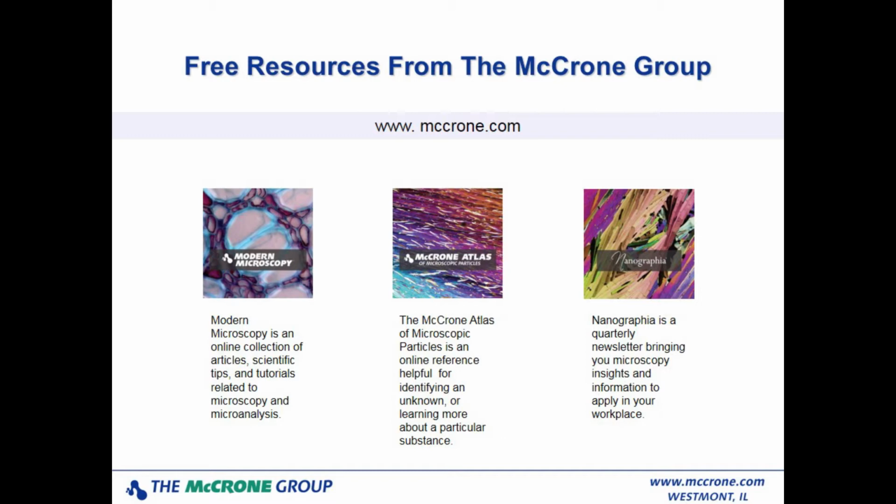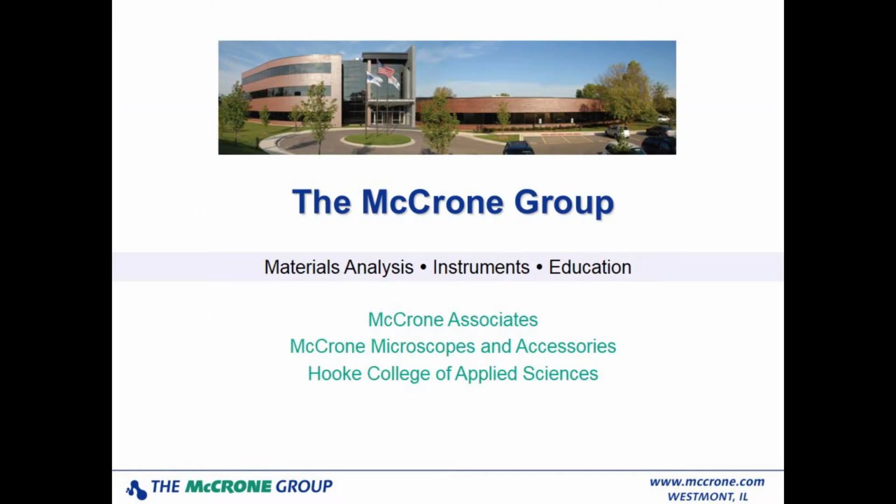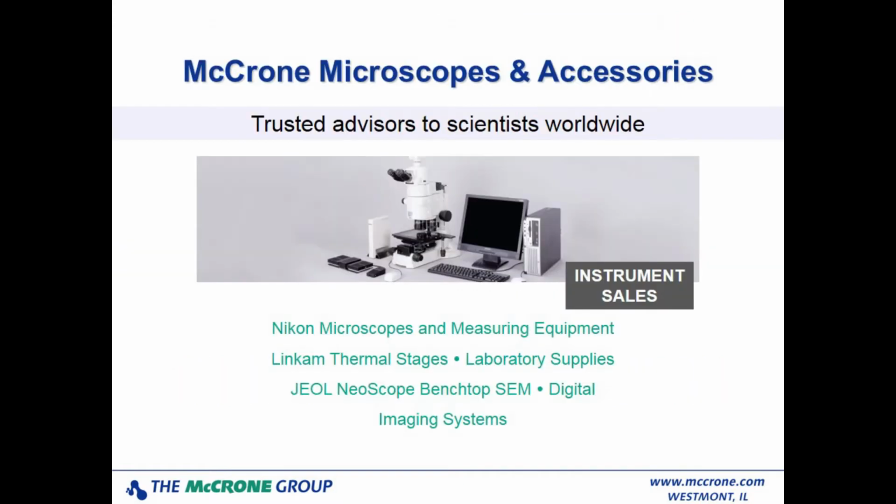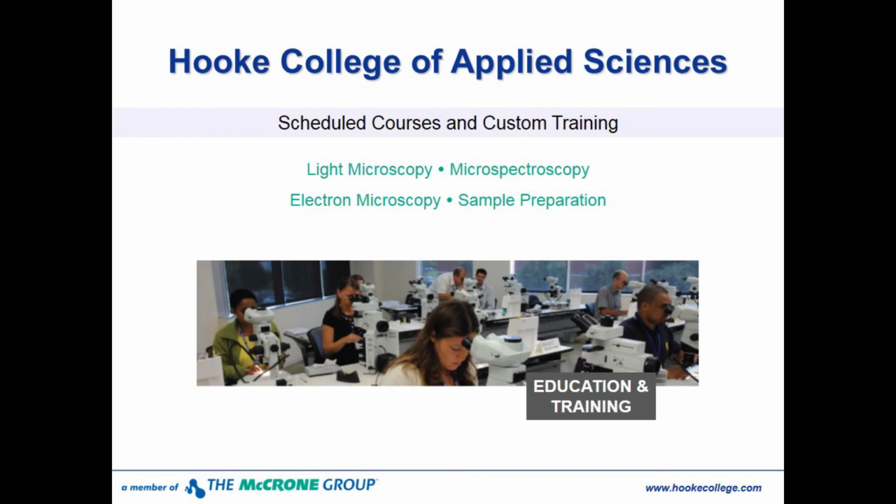He asks, how about when you have to clean a difficult to remove substance from the contaminants, like a silicone grease, for example? That's an excellent question and a difficult process. If I was fortunate and I had multiple specimens, then I would go about it sequentially after I had done all of my documentation. So I had looked at the sample, I had taken the stereo microscope. Typically, you can look at it with the polarized light microscope. So now I have some information at least that if I lose the sample, I can come back to it.